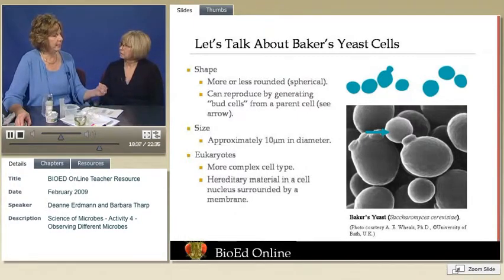There's another species of yeast that's used in the processing of wine and alcohol, and what happens with it is it gets into a condition where it doesn't have much oxygen present. As soon as the oxygen is depleted, it goes into what we call anaerobic respiration, or fermentation, and it produces ethyl alcohol. It's kind of interesting, and right away we can see that we've just looked at two microorganisms here, and they're not harmful at all, but actually beneficial to the food industry. And so what would we be without bread and wine?